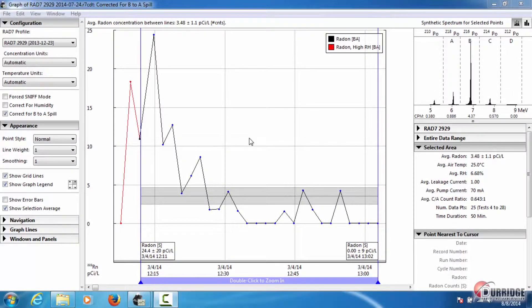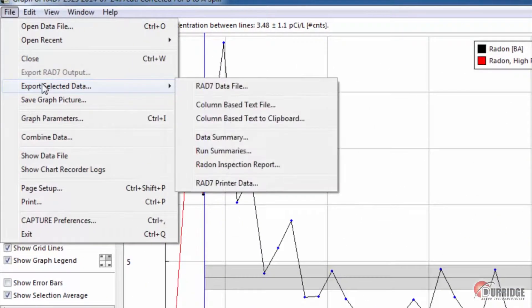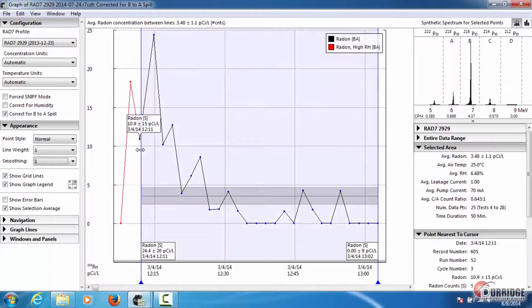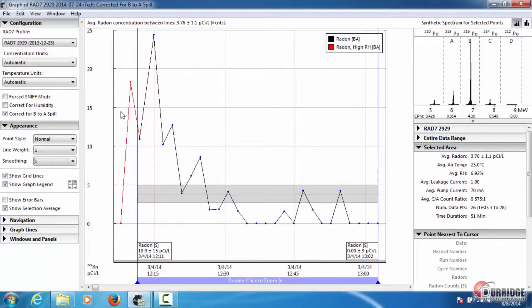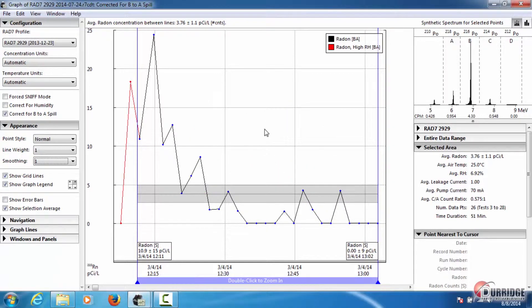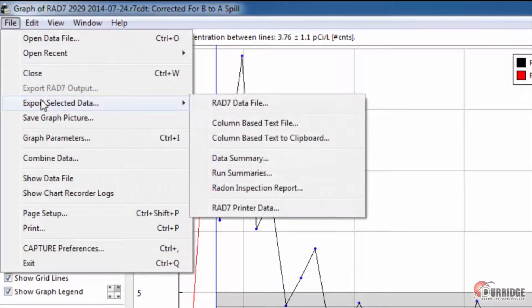You can export the selected area of your radon data from Capture's graph window in as many as seven different formats. First, drag the blue selection bars over the data that you want to export. As you can see here, I am cropping out the radon values that were recorded with a high relative humidity value. From the graph window, click File and select a format under Export Selected Data.